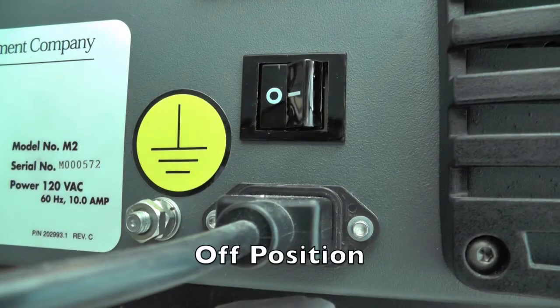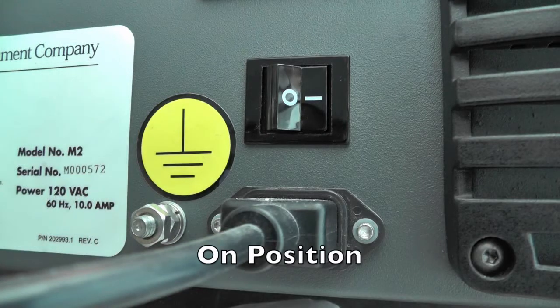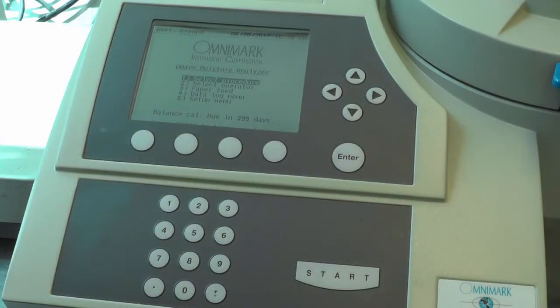Turn on the microwave moisture analyzer using the on/off switch located at the back of the machine right above the power cord. Wait for the main screen to appear.